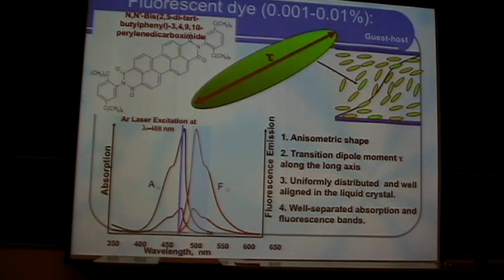Therefore, if you now obtain the absorption and fluorescence spectra for 2 orthogonal polarization directions, with one being parallel to the optical axis of the liquid crystal and the other being orthogonal, you will see very different spectra, with absorption and fluorescence being much stronger if the polarization direction is parallel to the liquid crystal director, along which all the dye molecules align parallel with their transition dipoles.